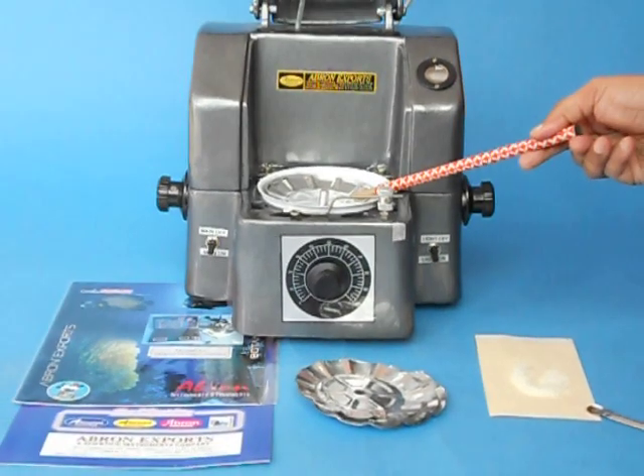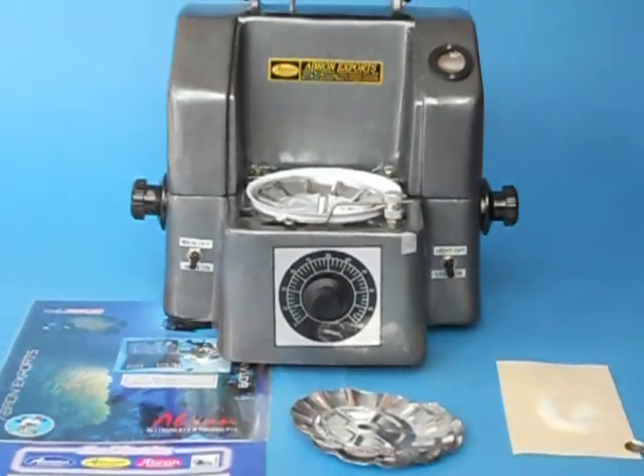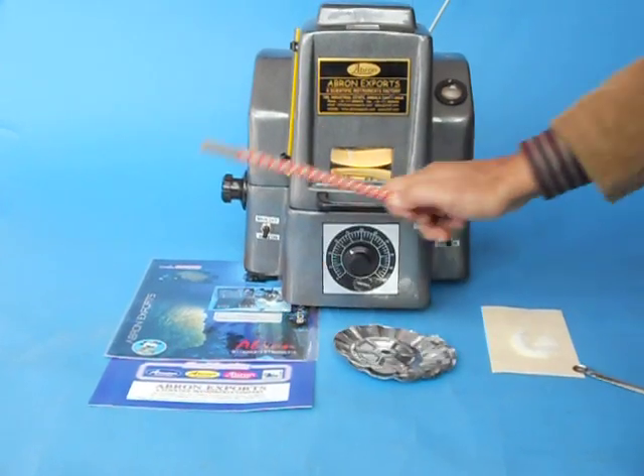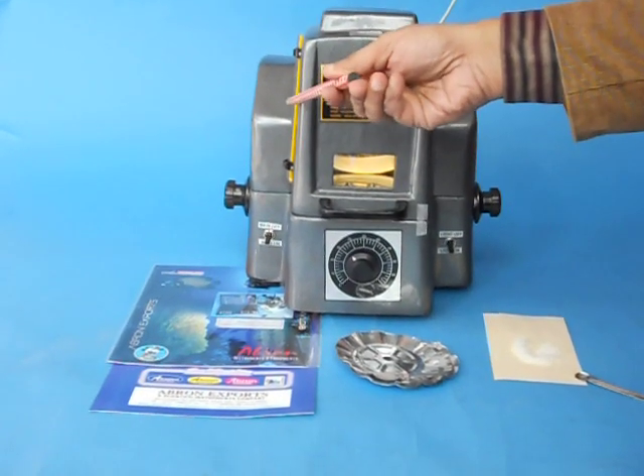Then put the sample in this, close it, and start the Infrared Moisture Balance. Note the initial temperature.